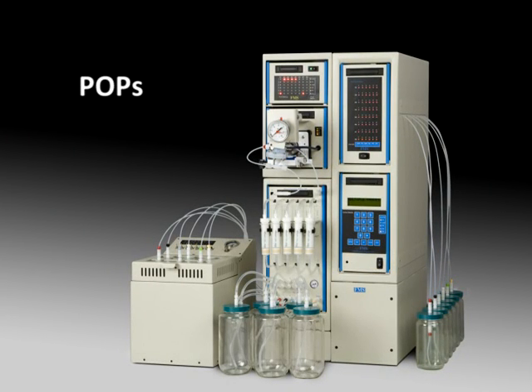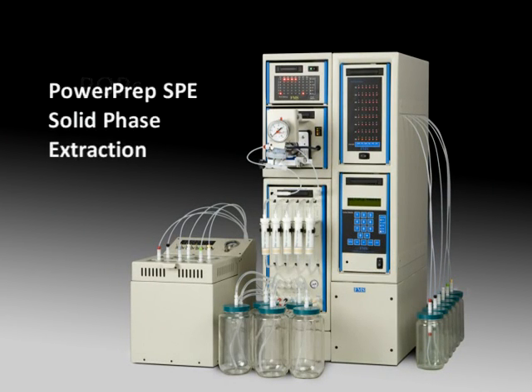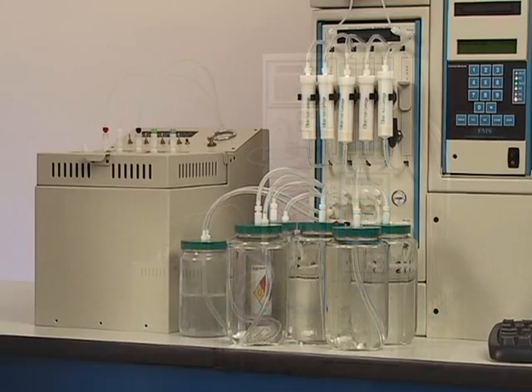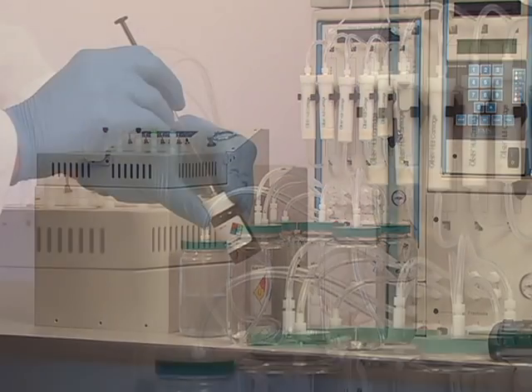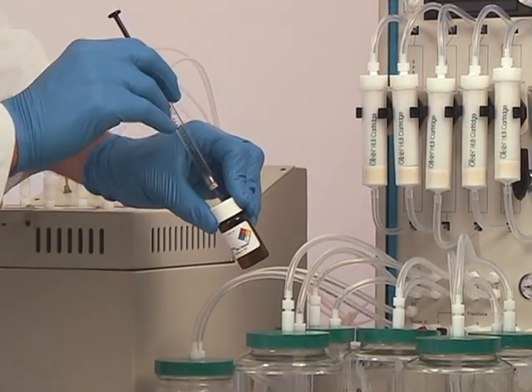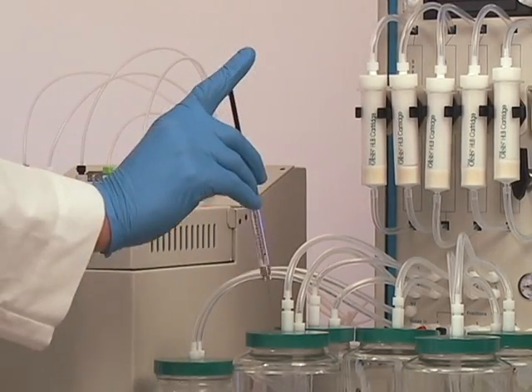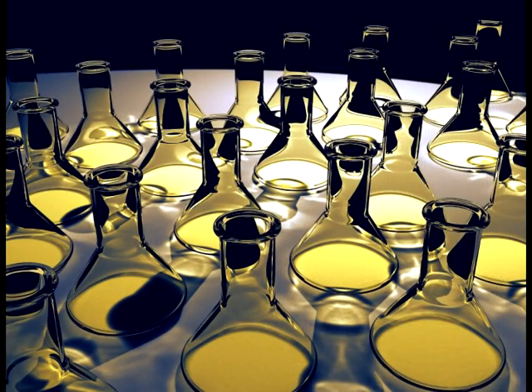The PowerPrep SPE system is a high-speed automated solid phase extraction system used for isolating analytes of interest from a wide variety of liquid matrices. Some include urine, blood, water, milk, or beverages. With the PowerPrep SPE, one just needs to load liquid samples onto the SPE system and press the start key.